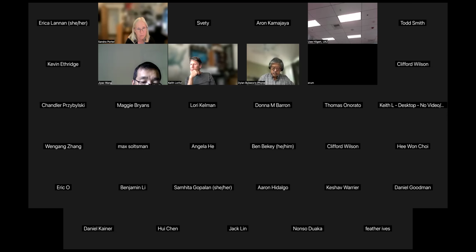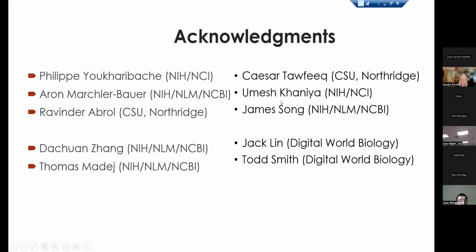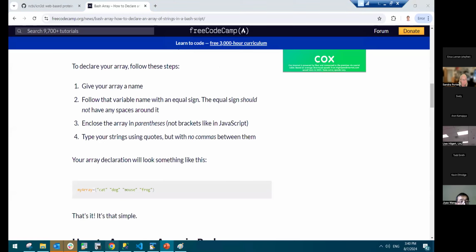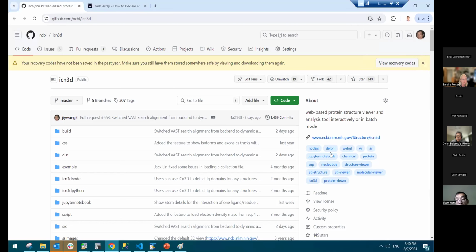Interactions, let me show you. Yeah, that'd be great. Thanks. Okay. Can you still see my browser? Mm-hmm. Okay, good.